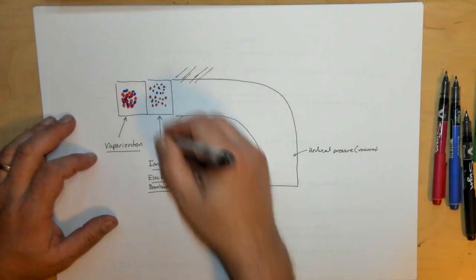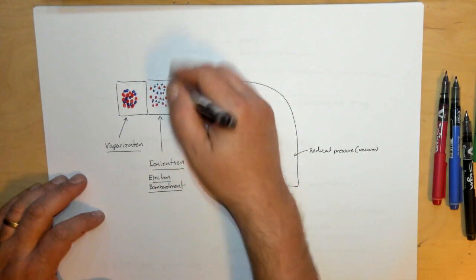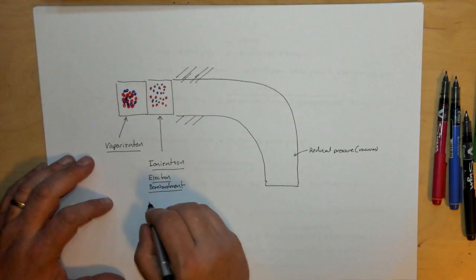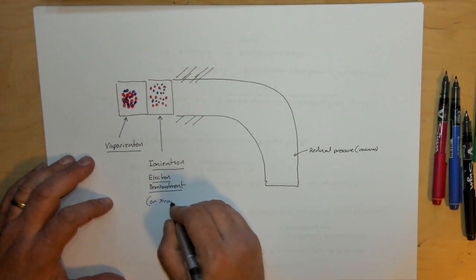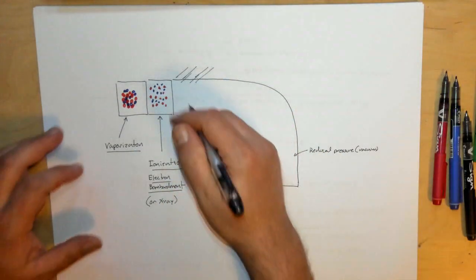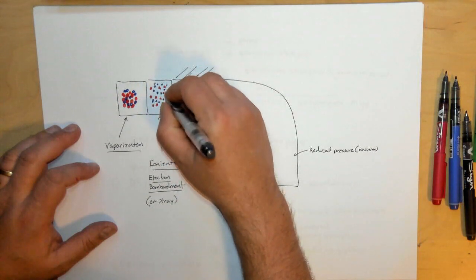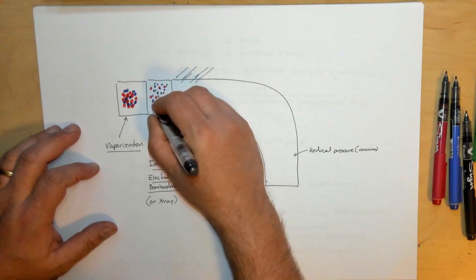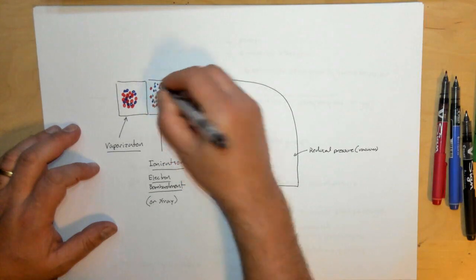So basically you shoot electrons at your sample, and the electrons knock off the electrons in the sample, so these become charged particles. And we'll just talk about that in just a minute. Sometimes it can be X-ray. That's another method. Any kind of ionizing radiation then. So what basically happens to these little particles in here is that they all become positive. The electrons are stripped off, or some of the electrons are stripped off, so all these little now vaporized particles become charged.